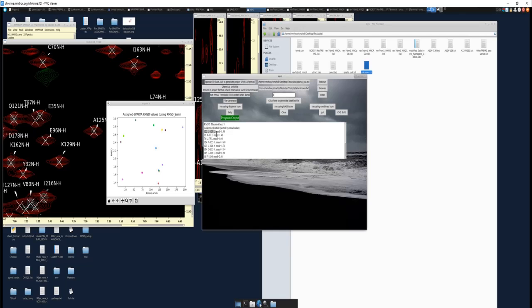We know that's not the case since we know both the I and I-1 are alanines. Here you have alanine 16 and aspartic acid 17. Again, that's not the case. If we go through, we'll notice we only have one alanine pair, 124 and 125, that matches these values. If you look throughout, there's not really any other alanine pair. So this immediately tells you in your amino acid which pair this is.